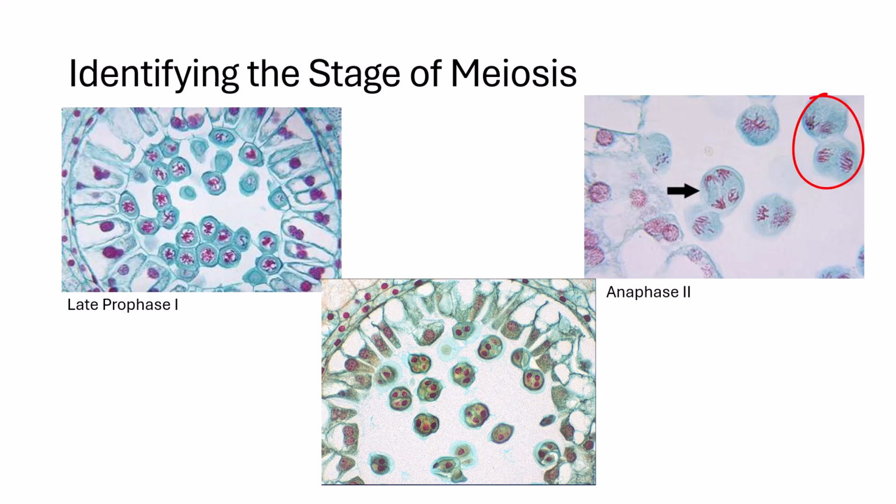In anther tissue, groups of pollen mother cells often enter meiosis at the same time. This synchrony means large clusters of cells progress through the same stages together, making it easier to identify patterns of chromosome behavior. When the pollen mother cell was cut, it may be positioned where half of the cell was cut, so you can't see the other half of the cell going through meiosis. So if you see 4 cells forming anywhere in that view, then you are in meiosis 2.